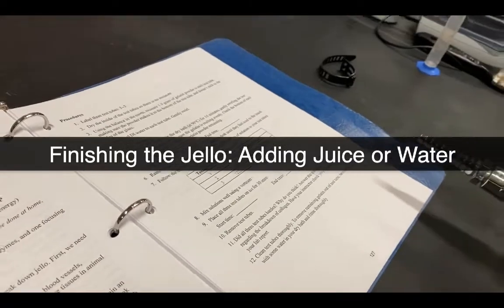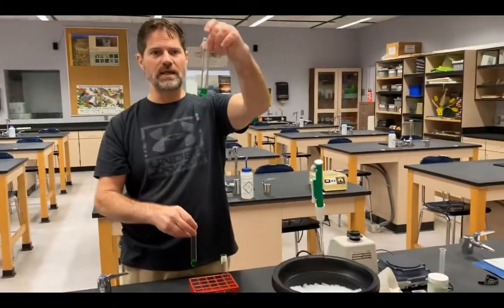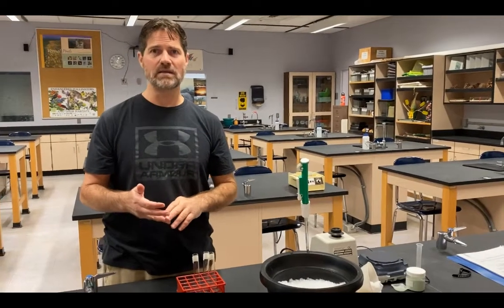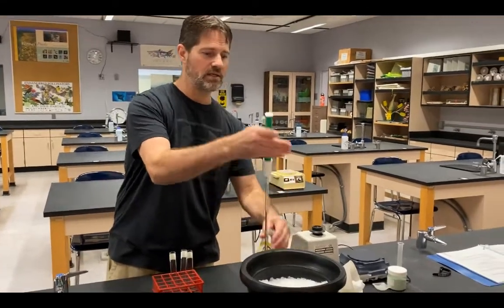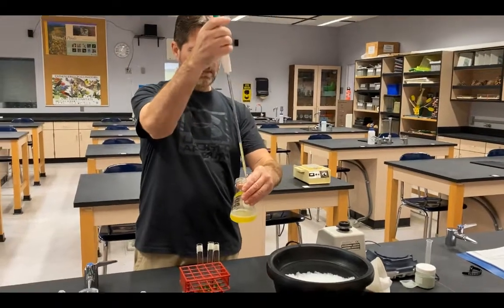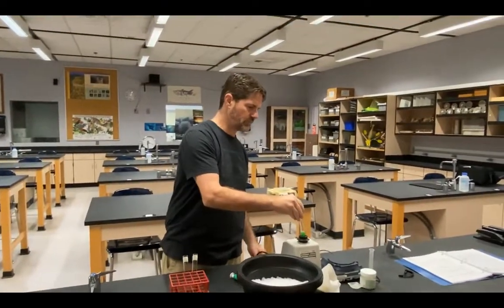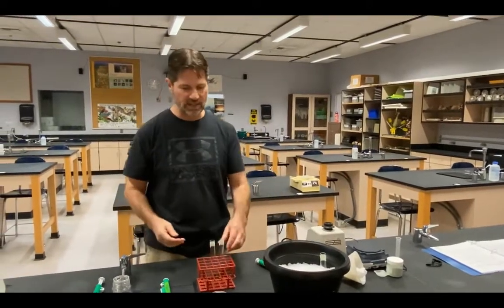Continuing from step six on page 127 of the lab manual: I have tubes one, two, and three, all prepared with jello — we added jello, added water, mixed, heated to melt, and allowed them to cool to touch. Now I'll add 2.5 milliliters of each substance to differentiate the tubes. I'll take 2.5 milliliters of fresh pineapple juice and add it to test tube one, mix it, then add it to ice to cool and potentially set.